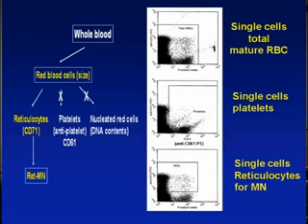By looking at the display, and by the way, this is set up by Stephen Dertinger. Of course, if you are very familiar with flow cytometry, you can have your own protocol set up. But since this is included in their kits, they suggest a protocol. So I'll go step by step and use his protocol. In case you want to do it yourself, you buy the kits, then it's very easy for you to follow.